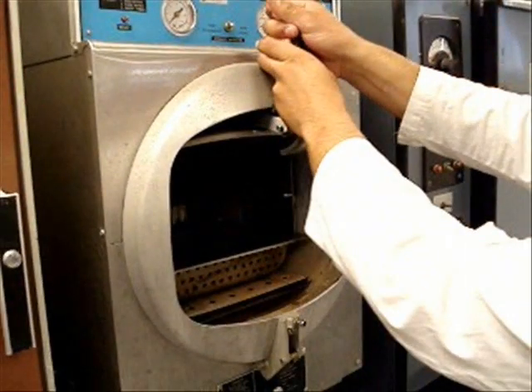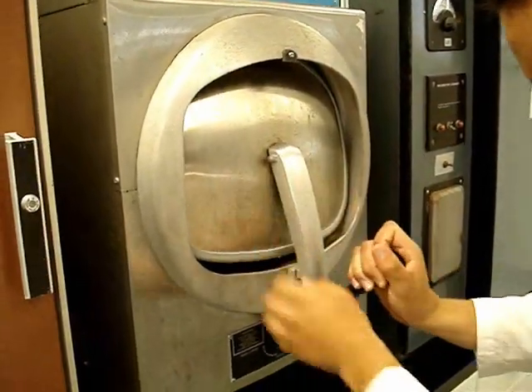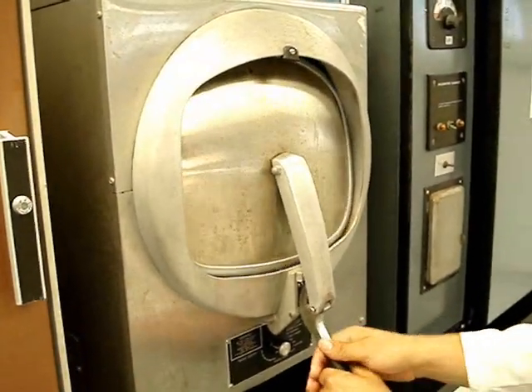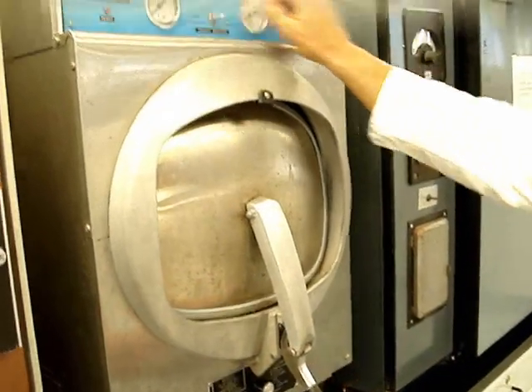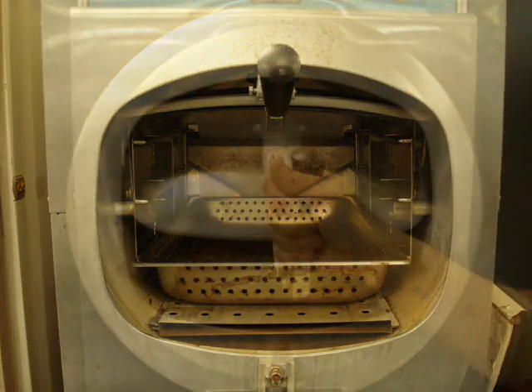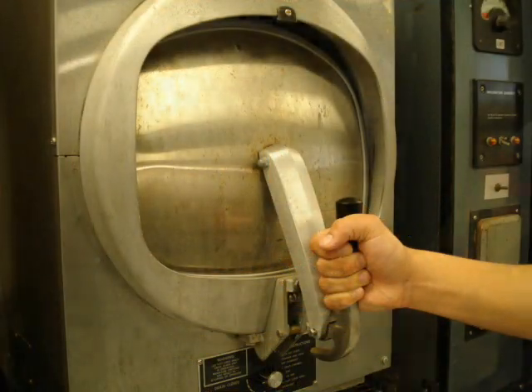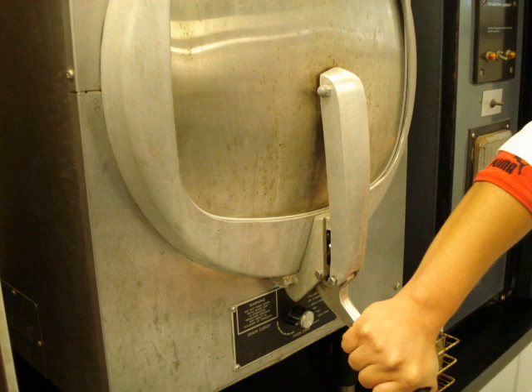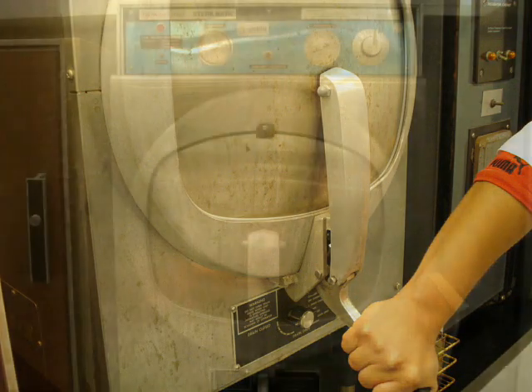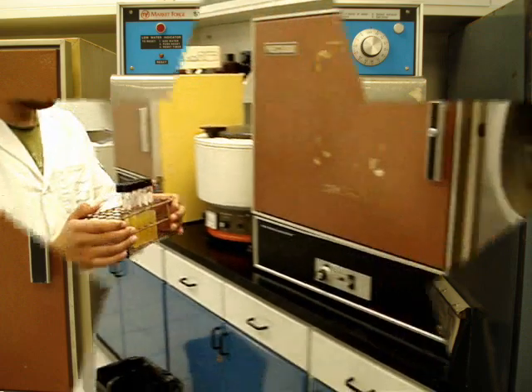Otro error grave es no saber cerrar la puerta del autoclave, como a continuación les muestra el compañero. Para cerrar el autoclave, tomas la manivela y jalas la tapa hacia ti, luego tiras hacia abajo y luego insertas el seguro para asegurar el cierre. Ya que está cerrada, se puede prender el autoclave.